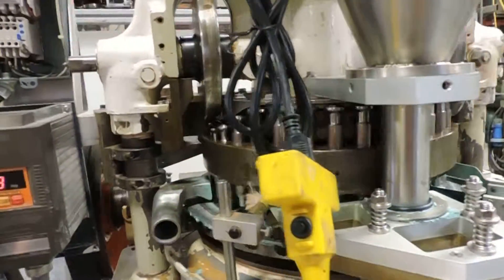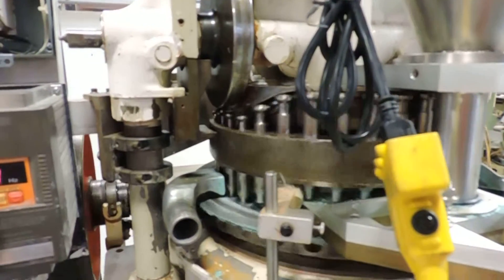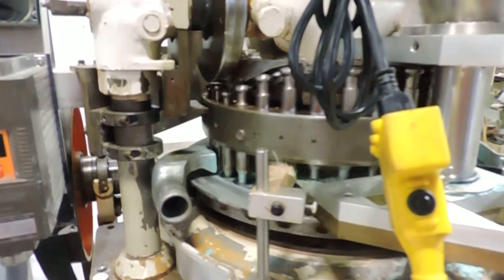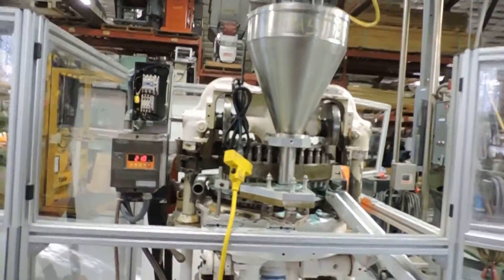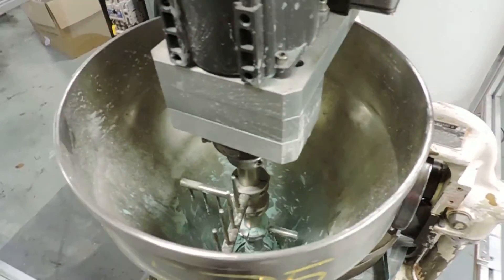That's the sound you're hearing. That's going back down. There's a small agitated hopper up here — I'm going to show you right now. There's a small pin-type agitator in here.